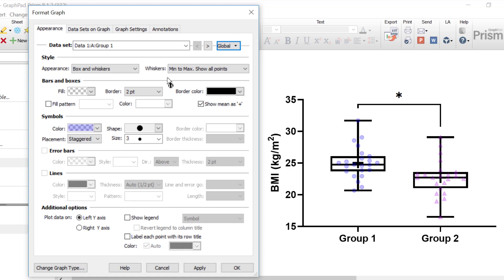In this quick tip video tutorial, you have learned about changing the global settings of a graph within Prism.